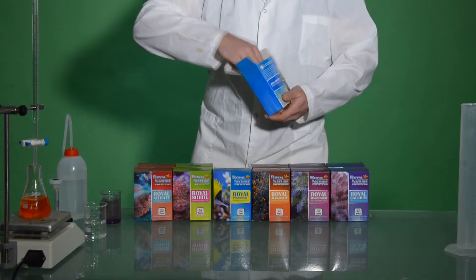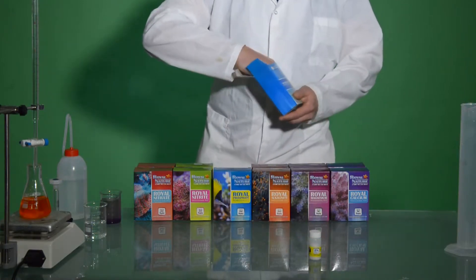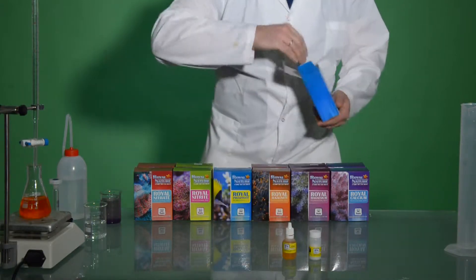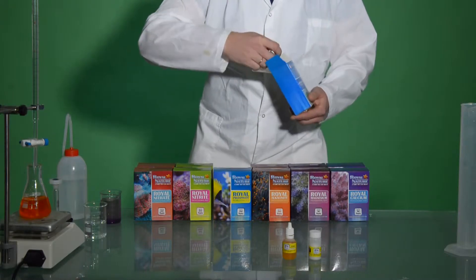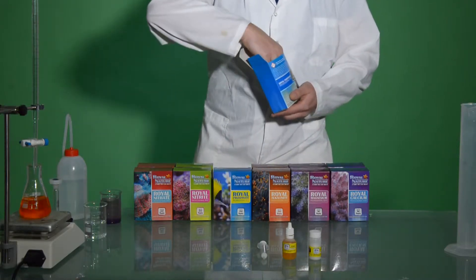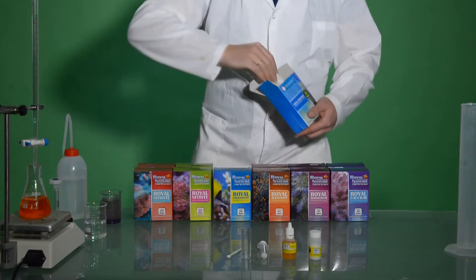and first we'll take out the powder marked as PO4-1, then the indicator marked as PO4-2, we have a syringe of 5ml, Test VL, and a measuring spoon.